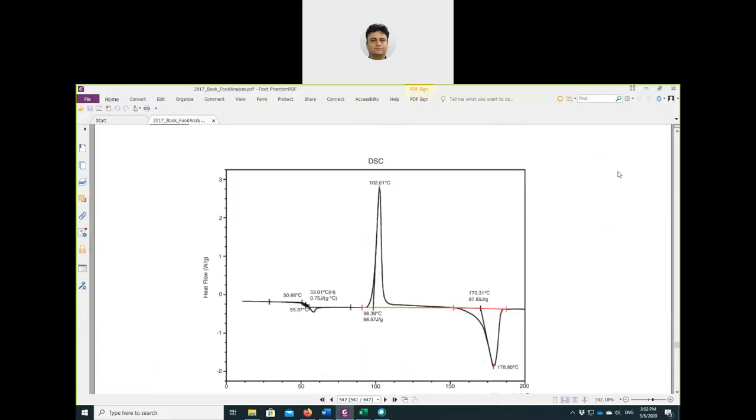I want to describe something about the DSC analysis. Please read through the handouts, check everything over there, and also watch the Prof. Karim video that I have shared with you to learn the basic things. But here I want to just describe something about the DSC chart.